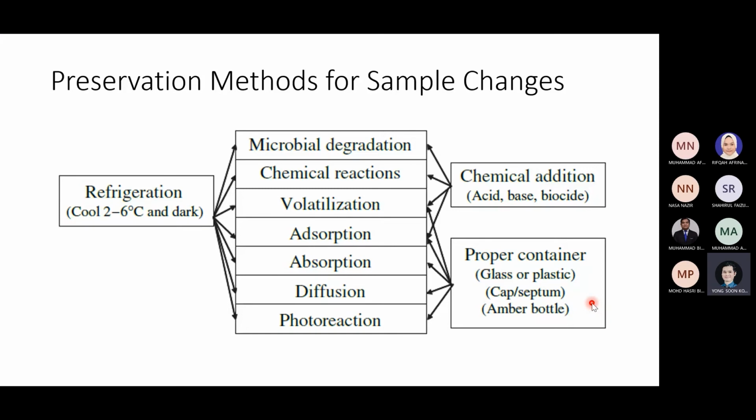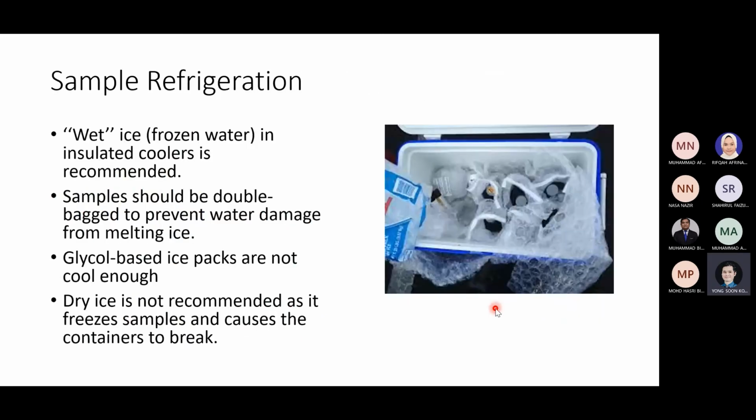It's just like your vaccine bottle on the top. You can poke through the needle and you inject, something like that. And also amber bottle, because if you have things that are photosensitive, amber bottle is what you need. Okay, a lot of story, but what's next is even going to be more challenging.